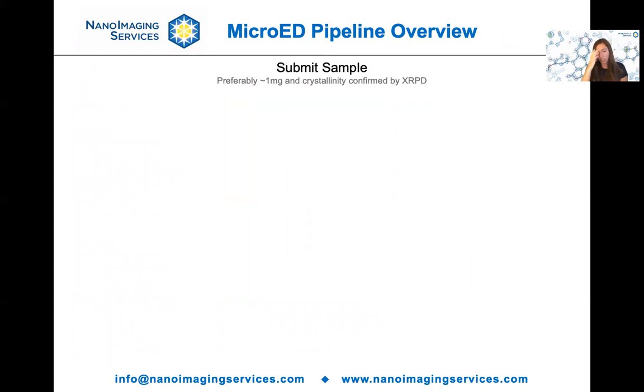We're asking our clients to submit samples as dry powdered crystals. We're asking that they send about 1 milligram of sample. We have ways of working with less than that, but that's a comfortable amount for us to scrape out of a vial and get onto a grid. We also ask that, if they're able to, they collect X-ray powder diffraction from a benchtop diffractometer, just to confirm that their sample is actually crystalline and worth spending the time and energy of putting it into the expensive microscope. We found that this is a really great screening tool, making sure that we don't end up putting amorphous samples into the microscope.